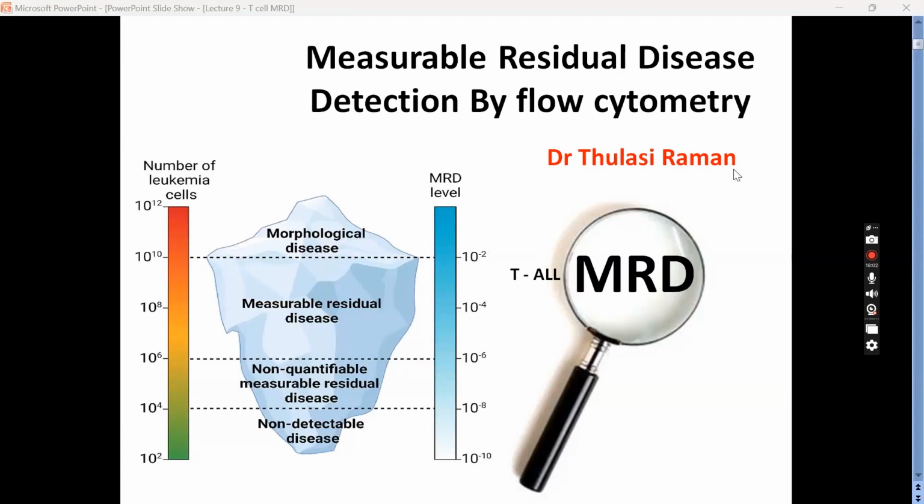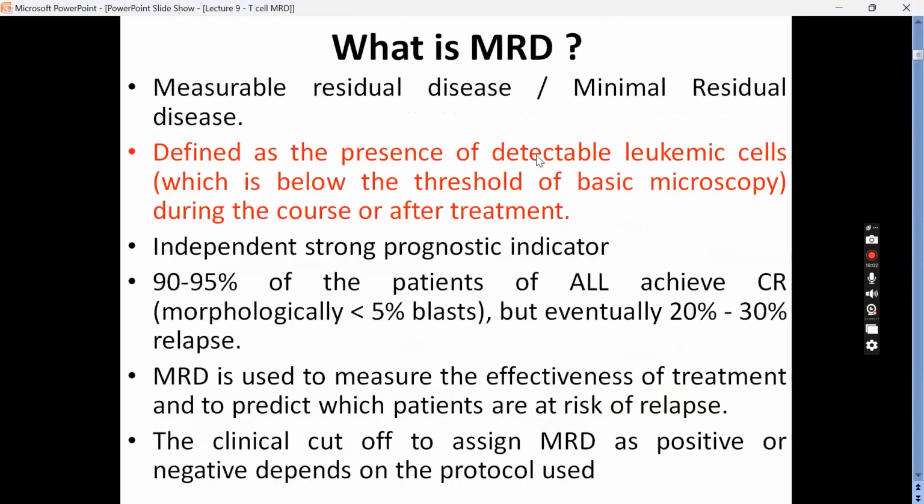So in case 9, what is in this panel? Case 9 is showing CD5 negative in T cell LGL. Sorry, come again. This one. Case 9, yes. Yeah, I agree. This is the one. So this is TLGL, gamma delta TLGL. This is gamma delta TLGL, not the regular TLGL. Okay, this is gamma delta T cell LGL. CD57 is positive. You mean to say still it can be negative? CD5 is negative in this.